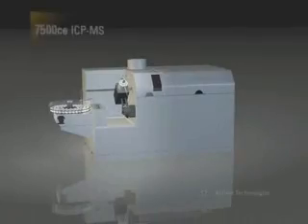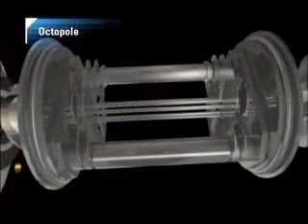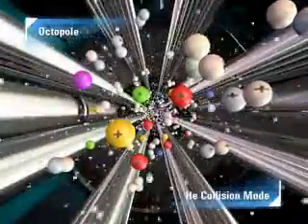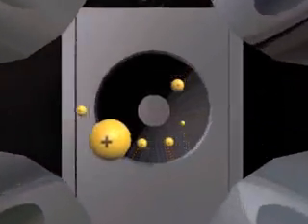The 7500 CE with octopole reaction system sets a new standard for ease of use, accuracy, and productivity in routine metals analysis with its unmatched interference removal capability, high sensitivity, and wide dynamic range.